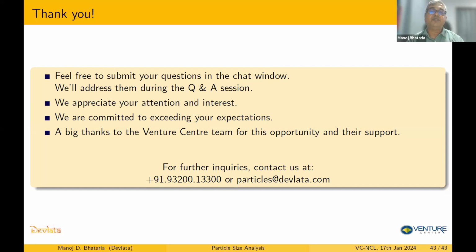In a microscope, you will only see a small portion of the whole sample, because you can't cover the whole sample. There are now microscopes which have a motorized slide. This will move the sample window by window in a small portion of time, and then it will cover the whole sample. Those kinds of microscopes are also available, but then the cost keeps on going up, and also the time required for the analysis.